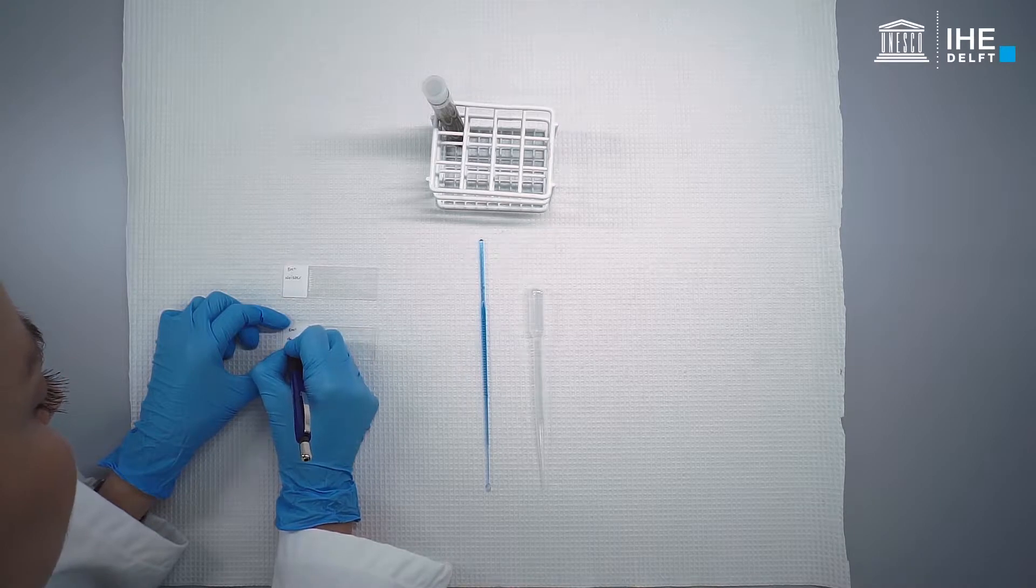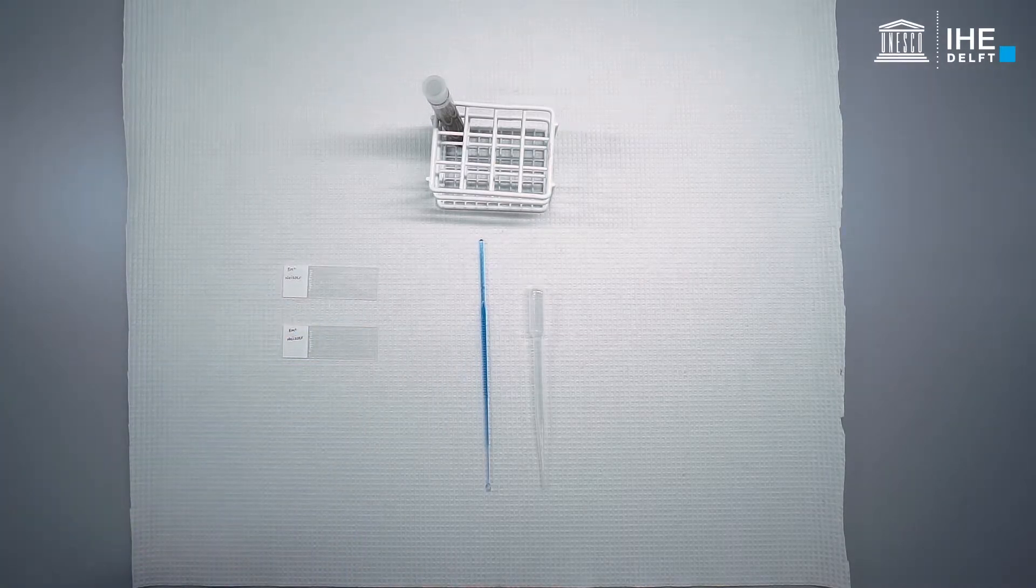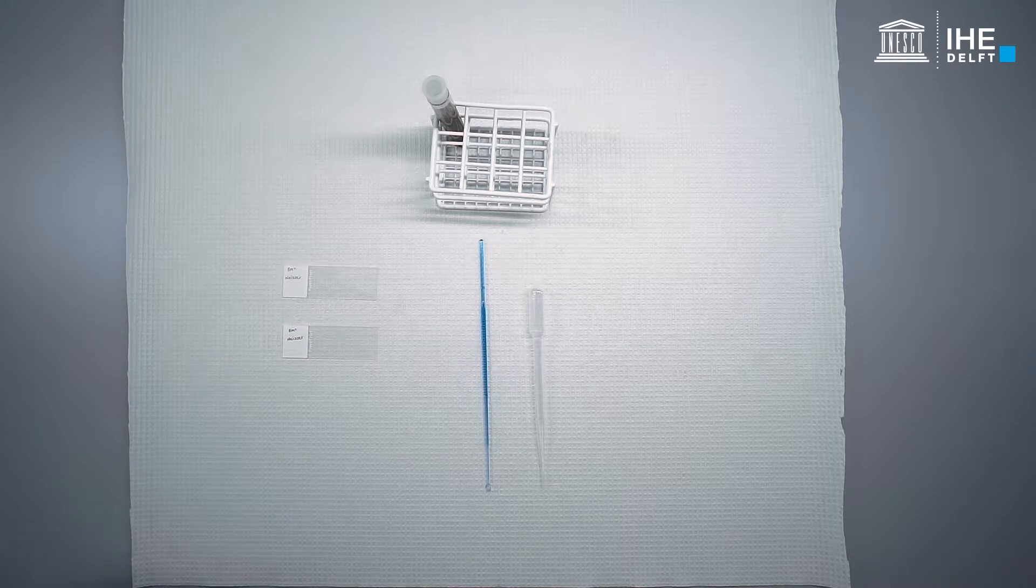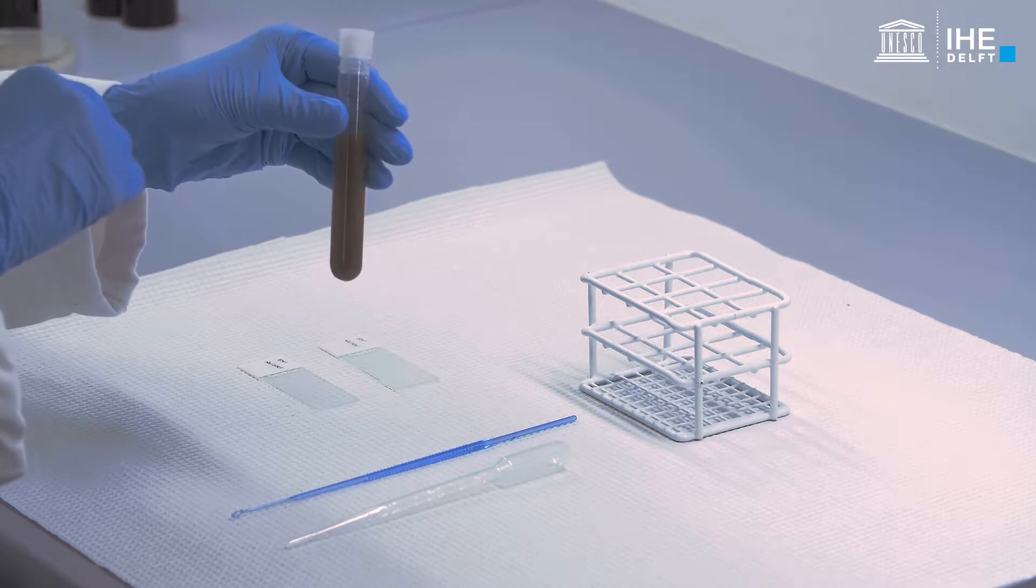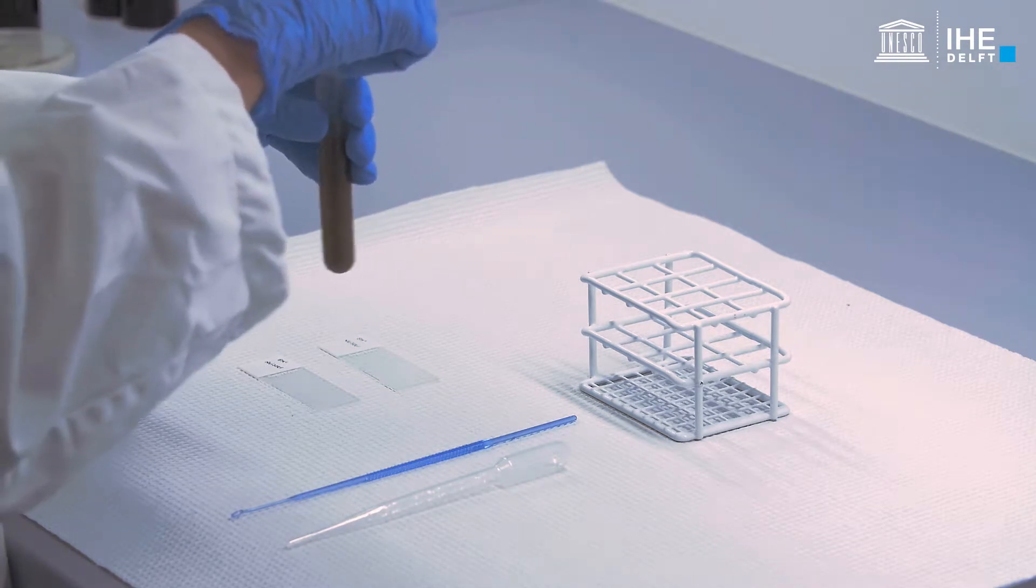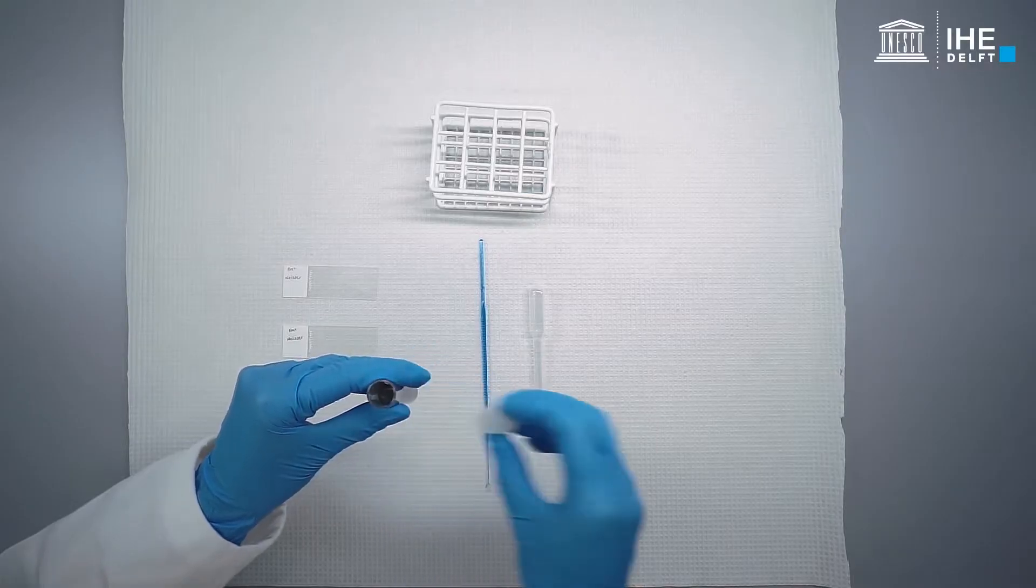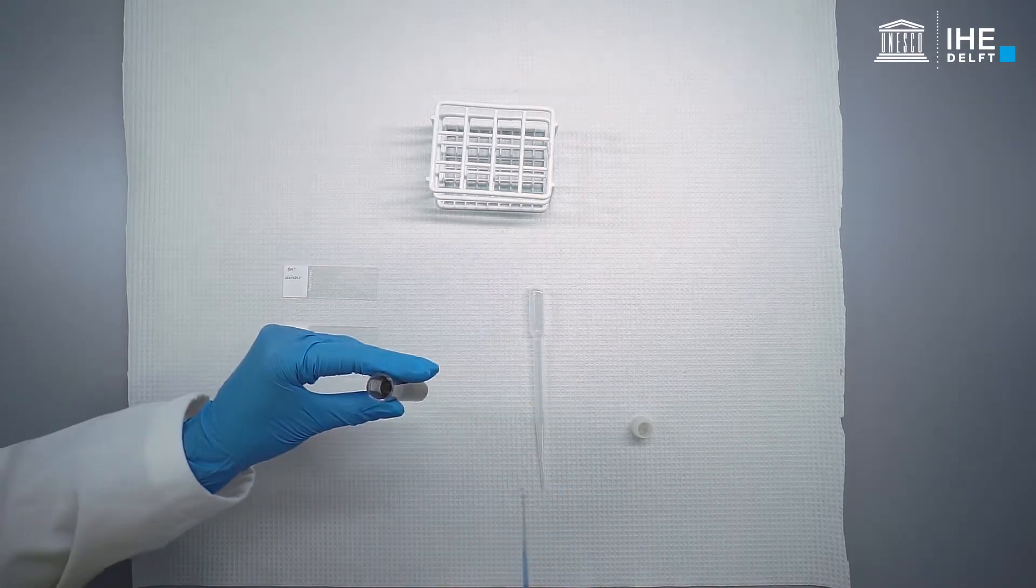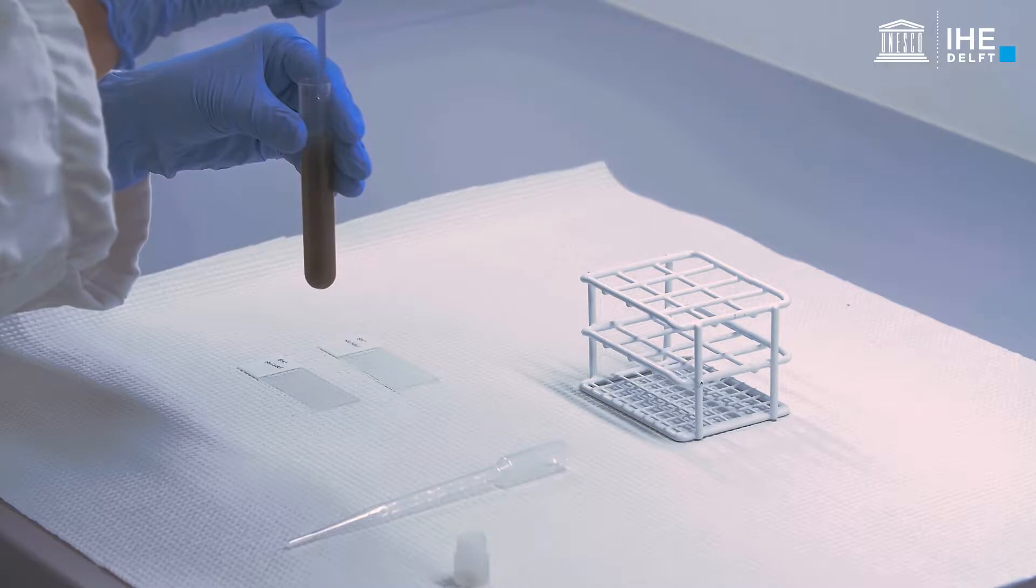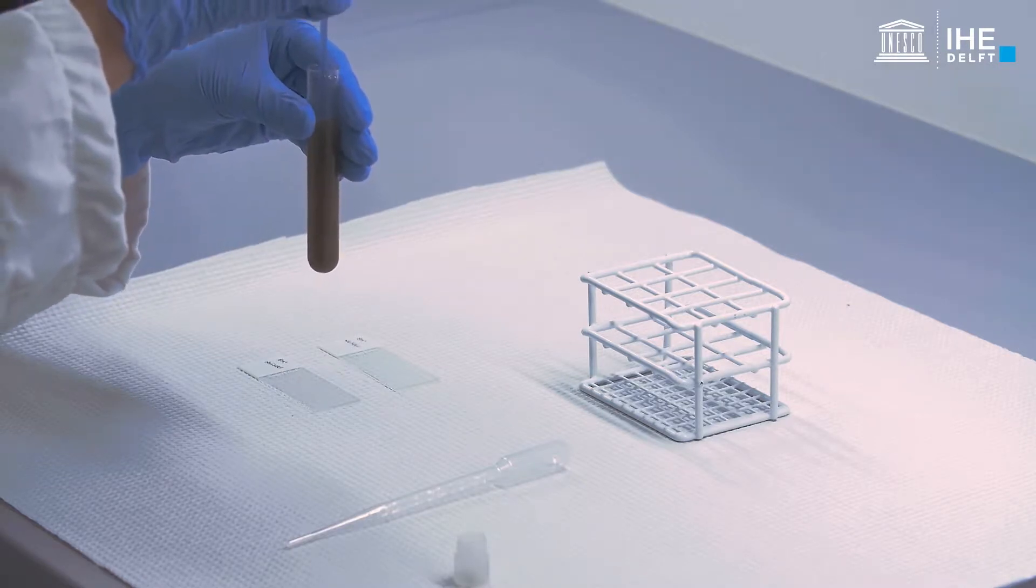Clearly label a glass slide with a lead pencil. To prepare a smear of an activated sludge sample, place a drop of sludge onto a glass slide with an inoculation loop or a single-use pipette. Carefully spread the sludge with a loop to form a thin layer of cells and allow to air dry at room temperature.